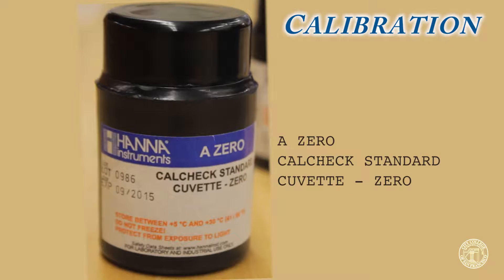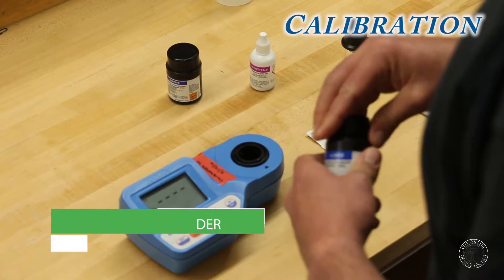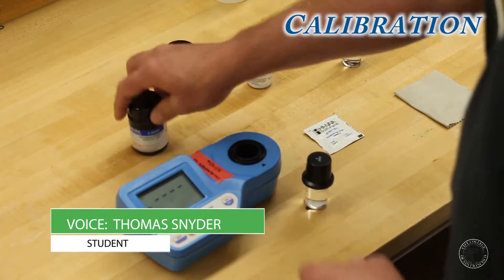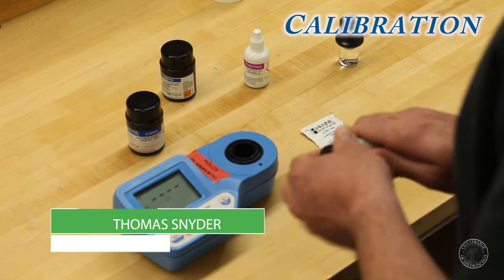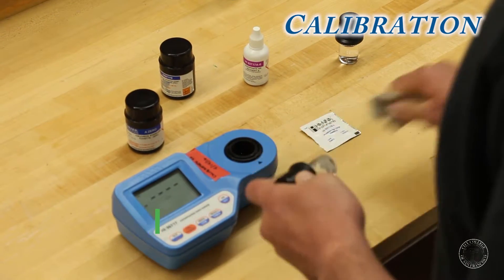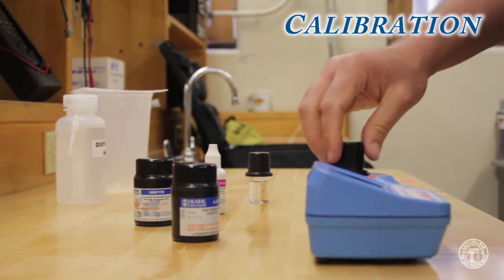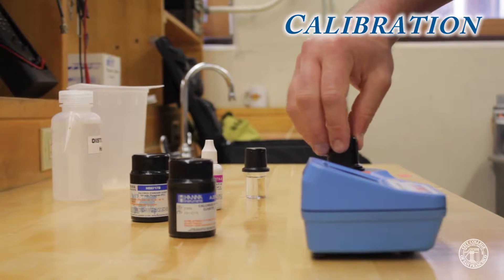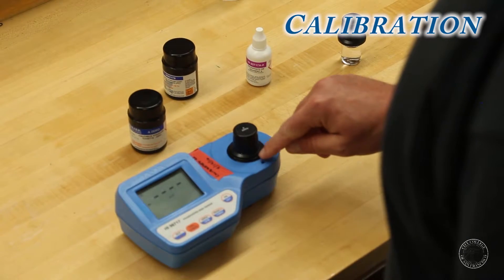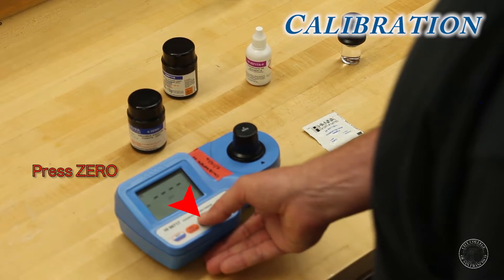Using your CalCheck zero standard, make sure to wipe the cuvette down. Then you'll turn to index it so the arrows will line up here. Then press zero.